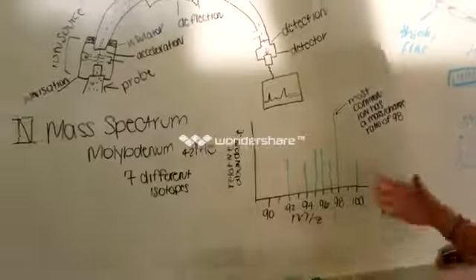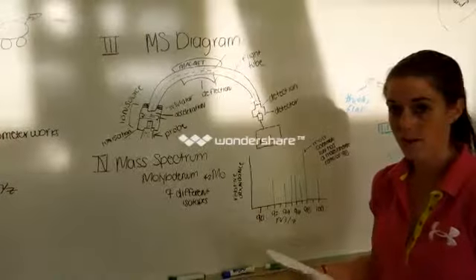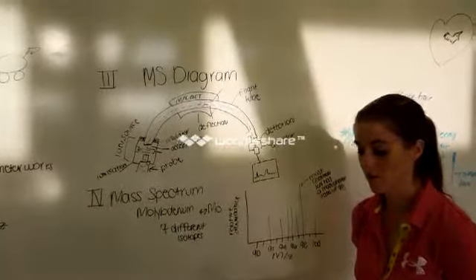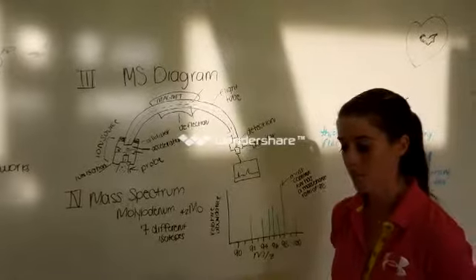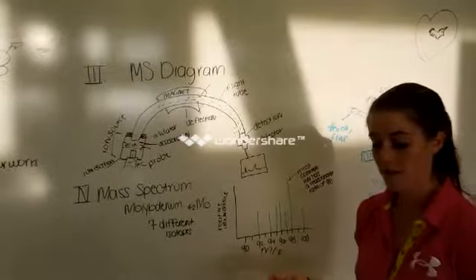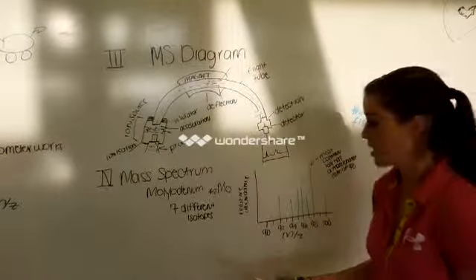So related to basically what I just said, the main applications of mass spectroscopy are both qualitative and quantitative. Qualitatively, you can identify unknown compounds. You can also determine isotopic composition of elements in a molecule, and you can determine the structure of a compound by observing the fragmentation. Quantitatively, you can quantify the amount of a compound in a sample, and then you can calculate relative masses, just like I showed here.